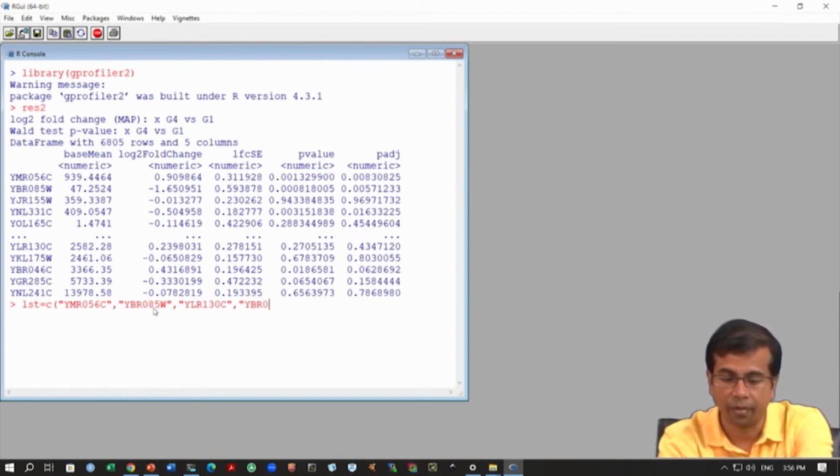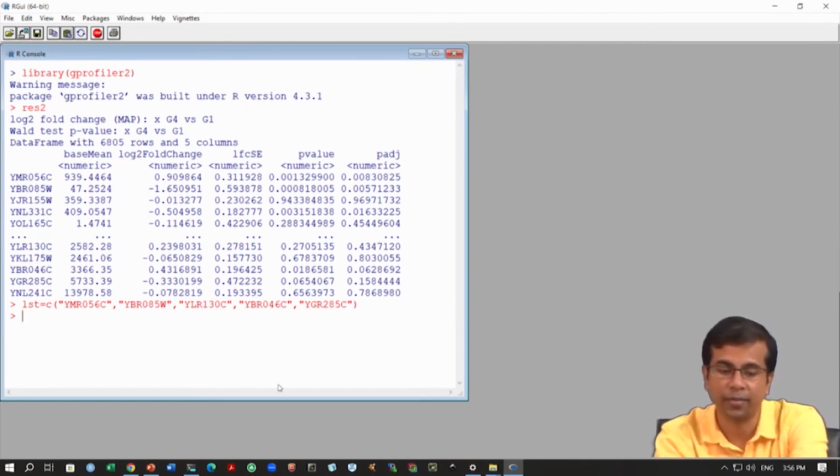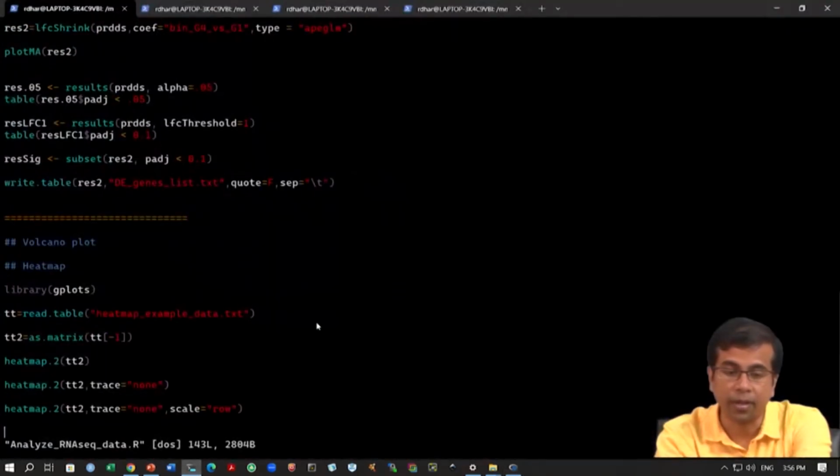So, here we are. Okay, I think this should be okay. We have given 5 genes and let us now run the analysis. So, how do we run this analysis?